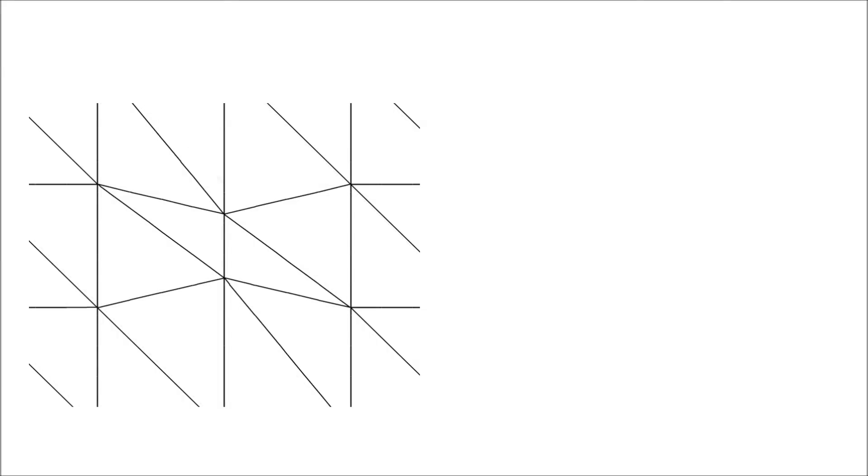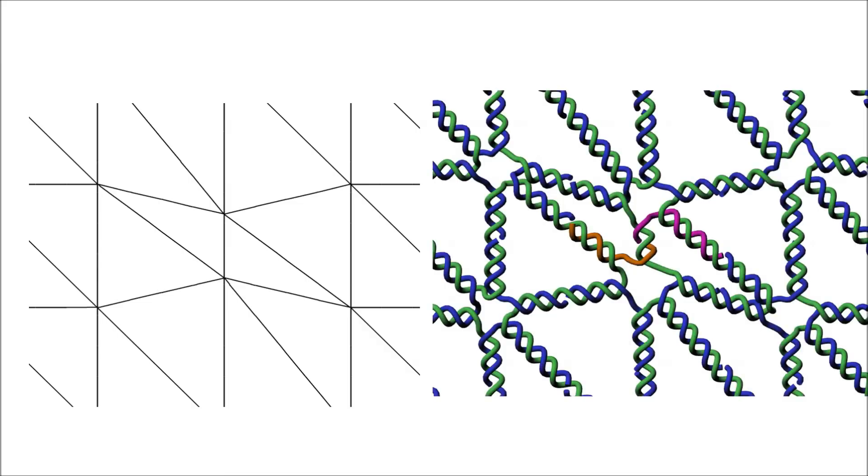If we then look at the DNA representation of the same mesh segment, with the default staple design, we see that the two staples binding to the shortened edge still have a breakpoint in the center. This means that their binding regions on the central edge are quite short, and this could possibly lead to poor hybridization stability.